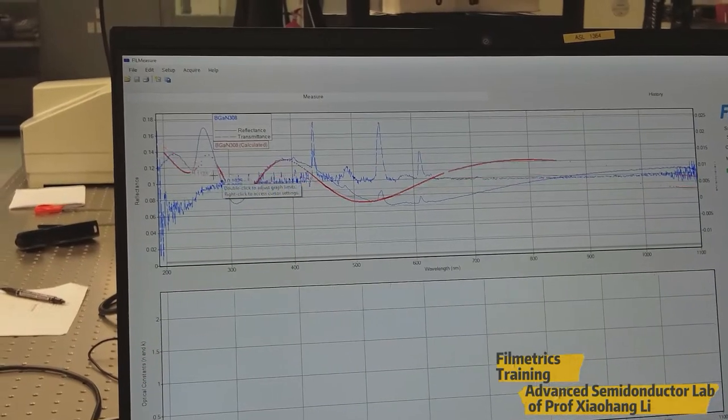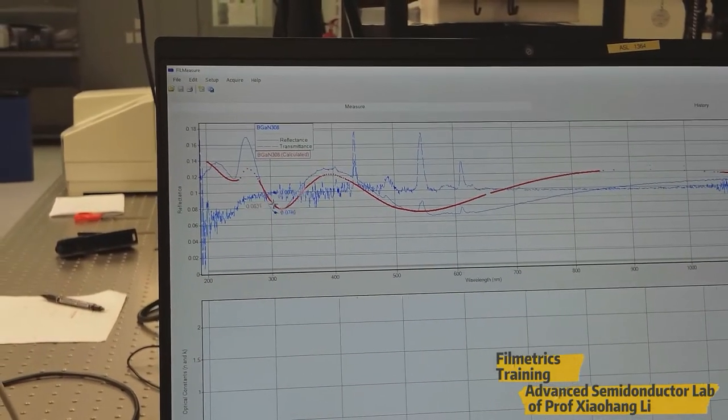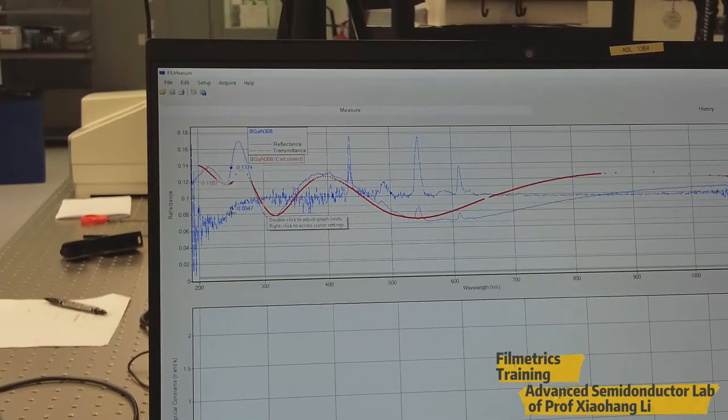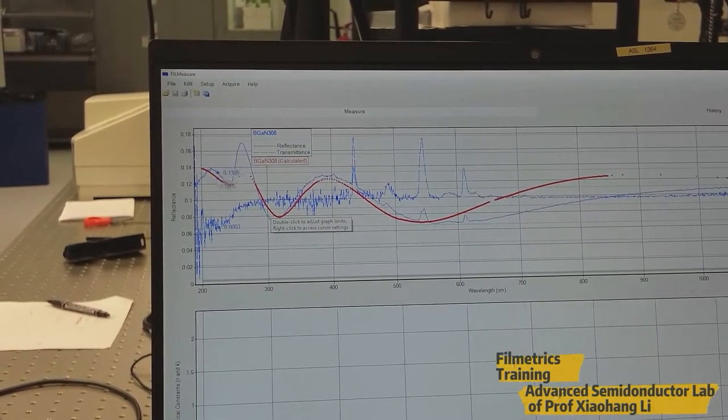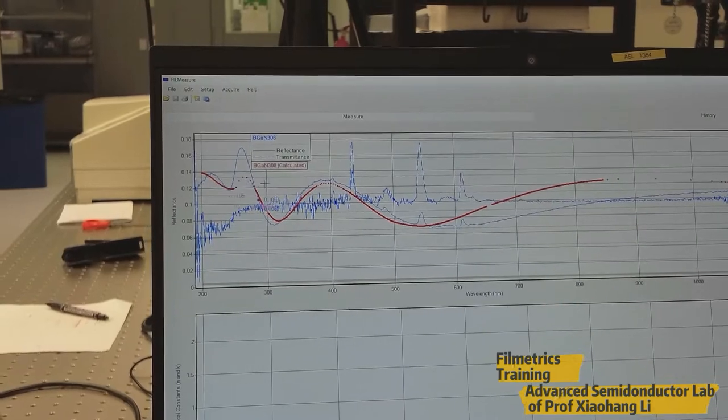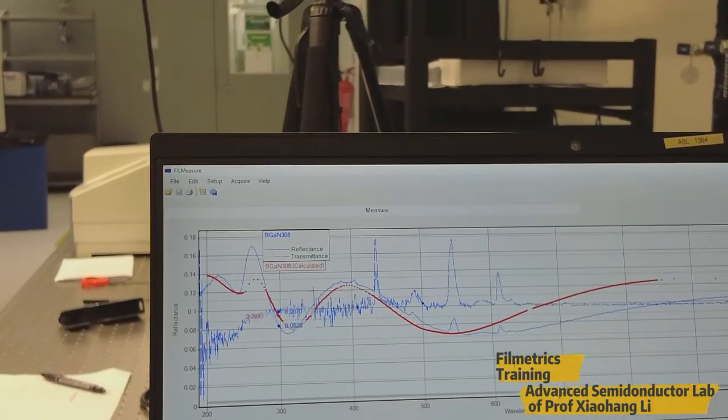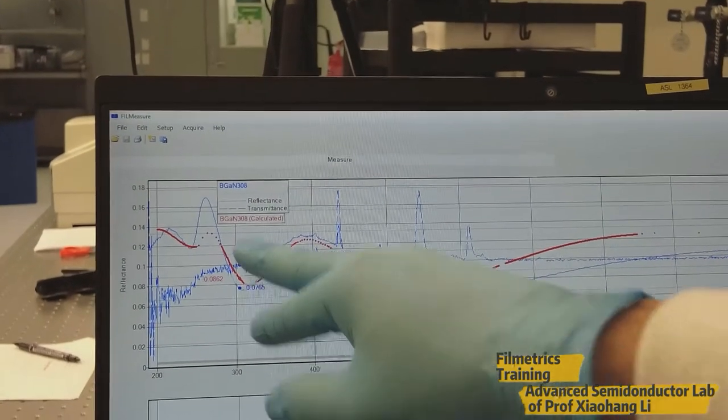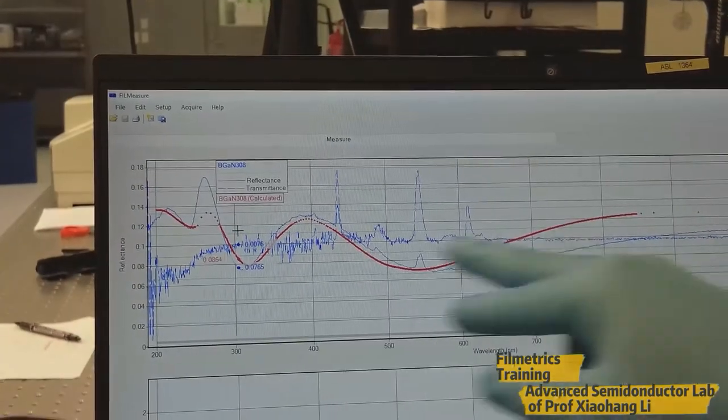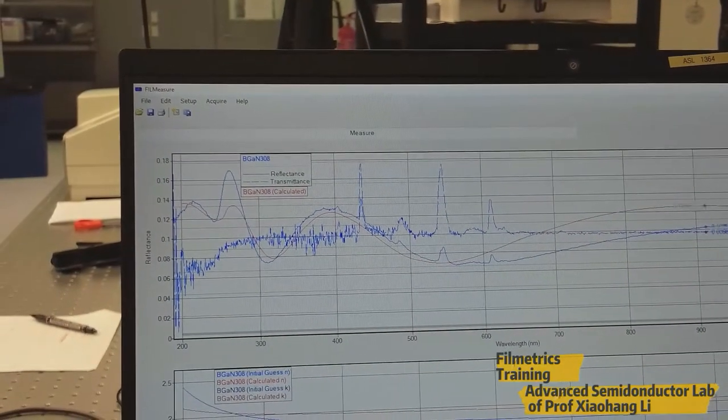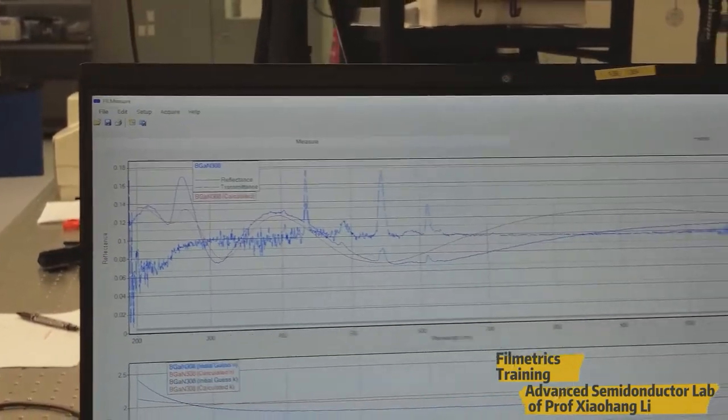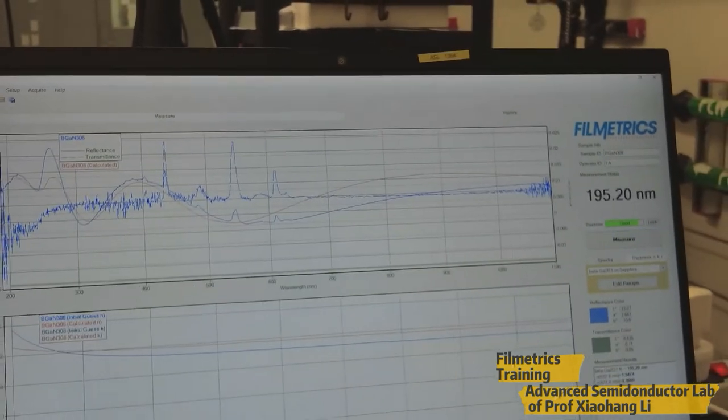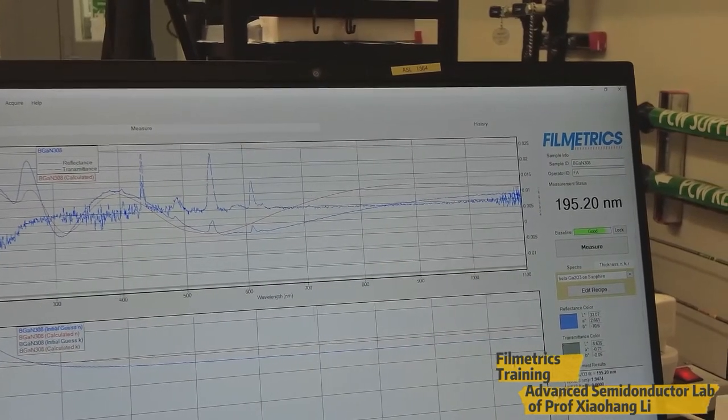So this solid line represents the reflectance and this dotted line represents the transmittance. So we are going to fit this solid line as a reflectance line to get exact value of the thickness. Right now it is trying to fit to get a better fitness. Now it is showing 195 nanometer thickness of the sample, but the goodness of fit is only 75 percentage. So we need to make it improve.